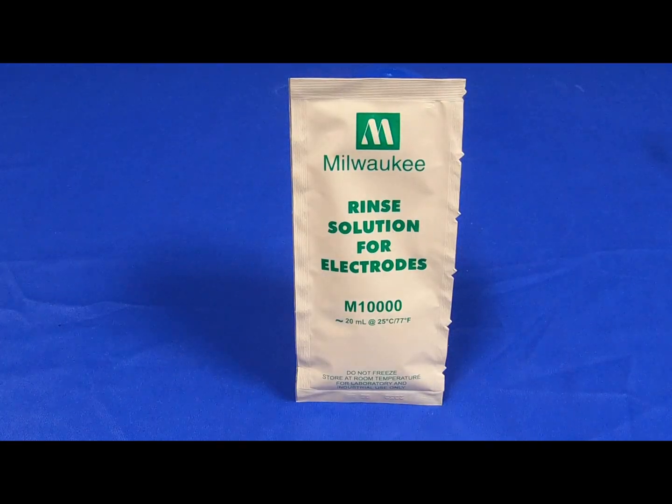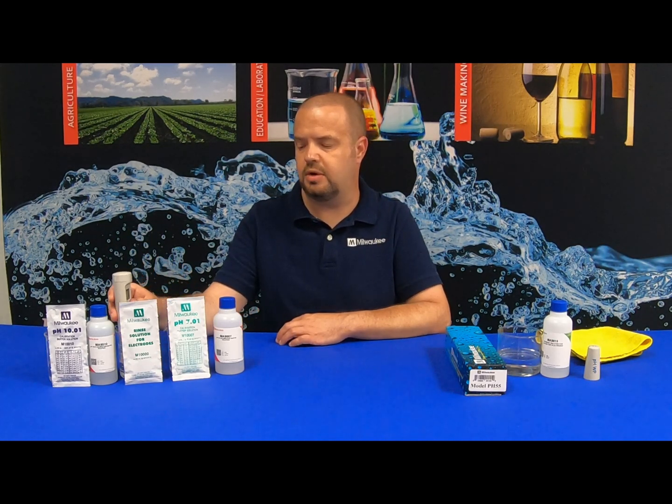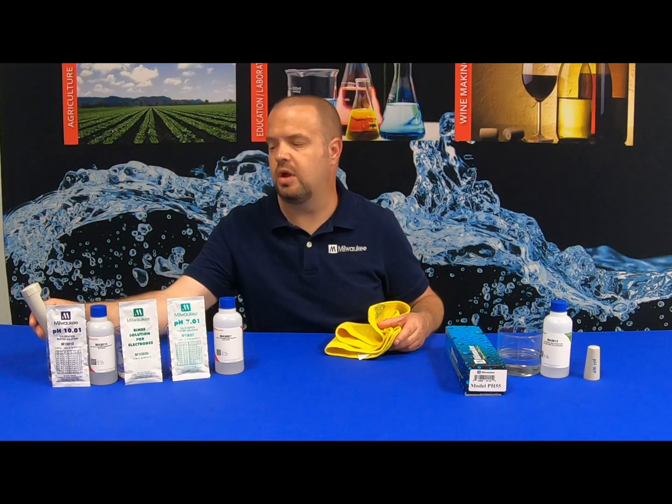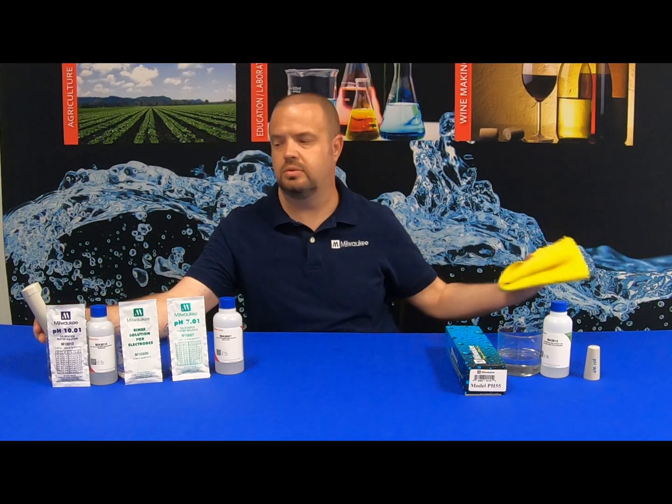Once this is done, we are going to give it a quick rinse in Milwaukee Instruments rinsing solution. If rinsing solution is not available, you can use tap water. Once I get the OK-1, I'm going to take it out, give it a quick rinse in the rinse solution, dry it off, and then we're going to stick it in the ten calibration solution. We're going to wait for it to read OK-2, notifying us that the ten side is calibrated.